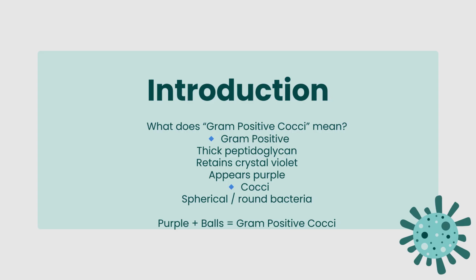Now to get into the details of gram staining, I have already uploaded a video on gram staining. You can watch that. But briefly, if the cell wall of the bacteria has a very thick peptidoglycan layer, then it retains the primary stain of the gram stain, which is crystal violet, and it is violet in color. So when we decolorize them or wash the bacteria, it is not washed off and it retains this purple color and appears purple under a microscope. So these organisms are called gram-positive organisms because of the structure of their cell wall.